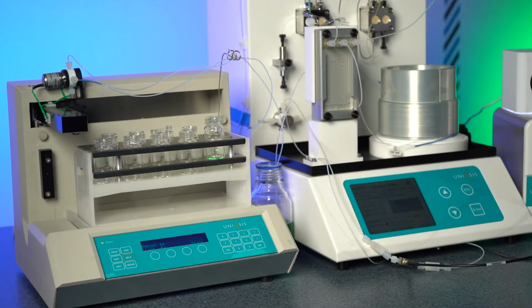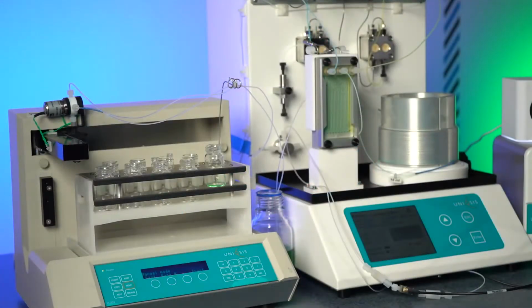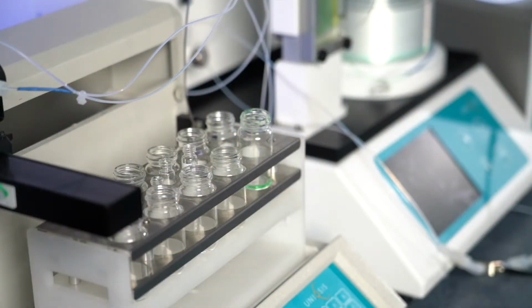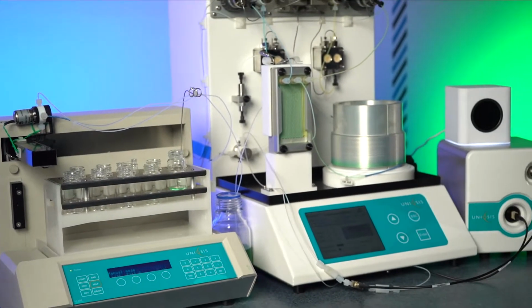Here the solvent and the reagents are going through the mixing chip. And as you can see, the green color is now in the mixing chip and is starting to enter the coil. And as it exits the coil and goes through the flow cell, we'll be able to see the signature on the bottom screen here.